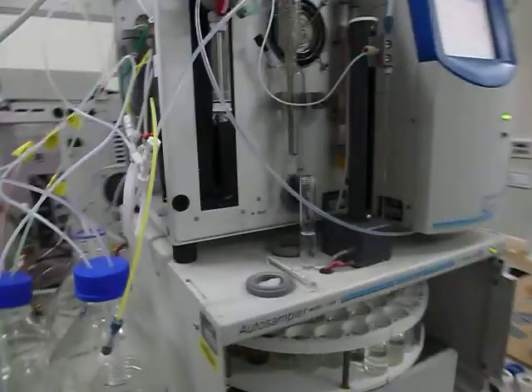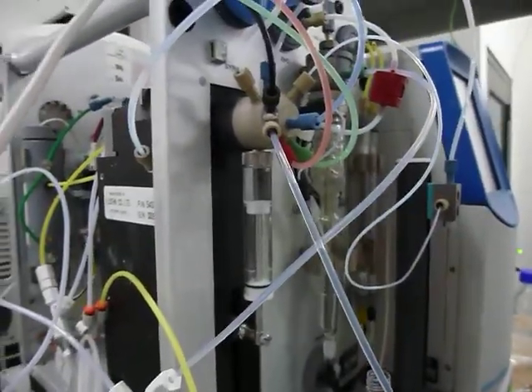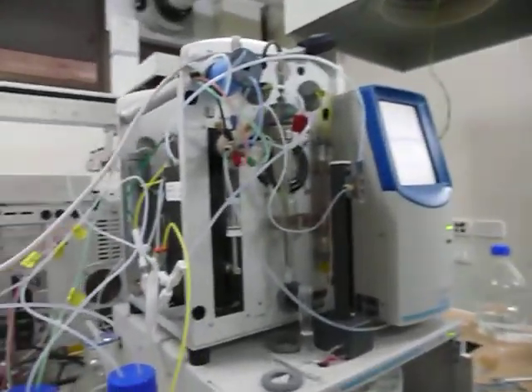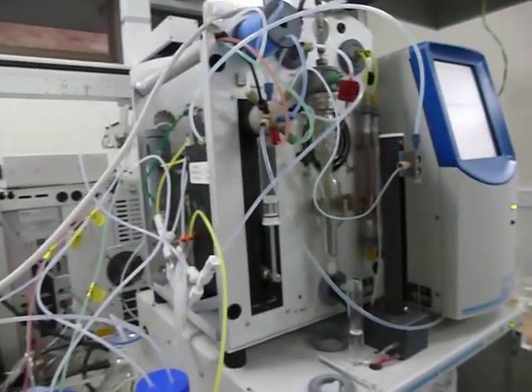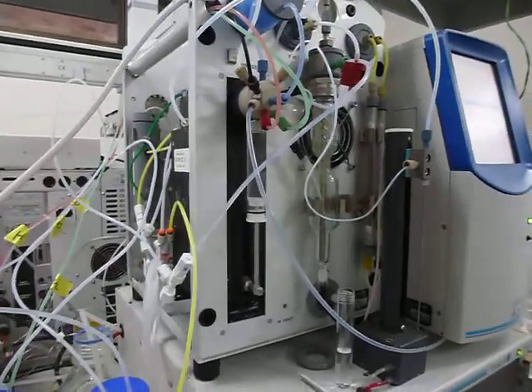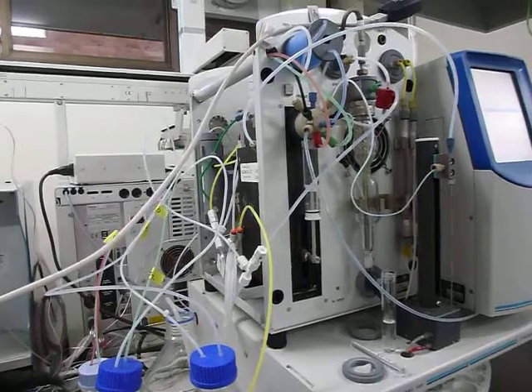So now let's see. It's doing its thing. There is a syringe pump here. It's sucking some water. It's the rinsing water, inside this big bottle here. And then it does a cleaning process, so it cleans the lines.